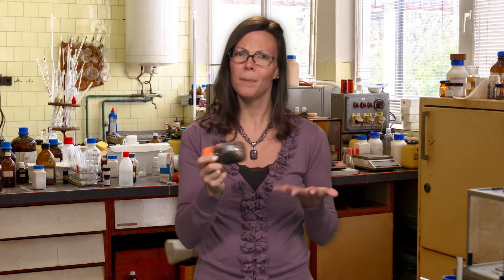Many times we don't have the luxury of working with clean samples. Today I'm in the lab with some of the dirtiest, grimiest samples that if I put them in my LC-MS system would just wreak havoc. I degrade columns a lot faster and get low sensitivity, which eventually leads to having to shut down the system. So after a day or two of cleaning, it's back up and running and then I cringe on the first injection. There's got to be a better way to at least remove some of this unwanted grime and in the end actually get better results with higher sensitivity.